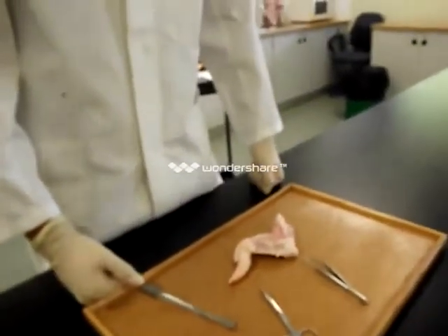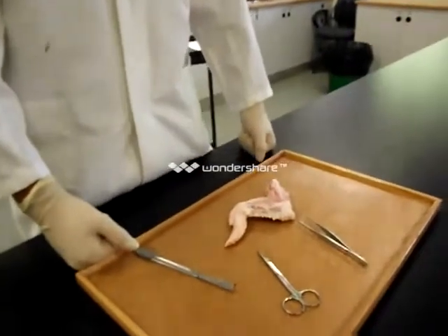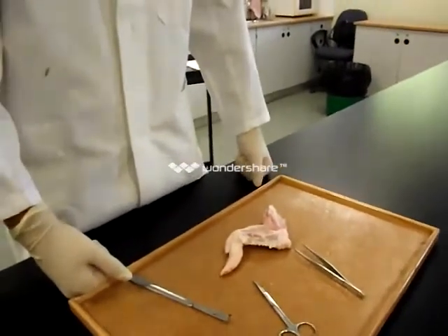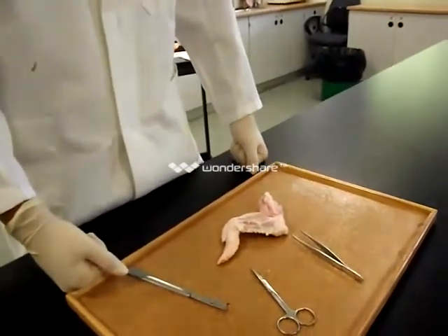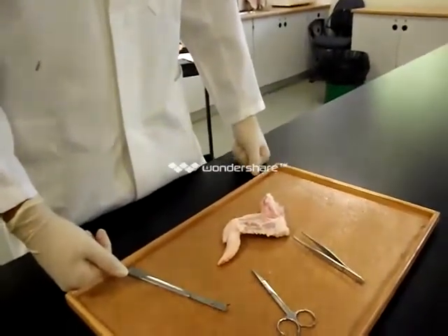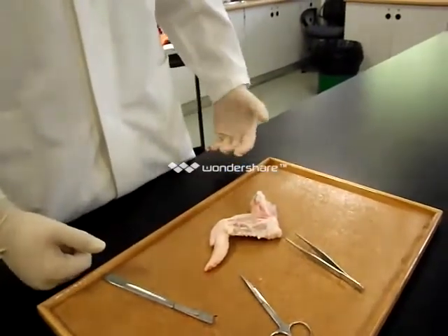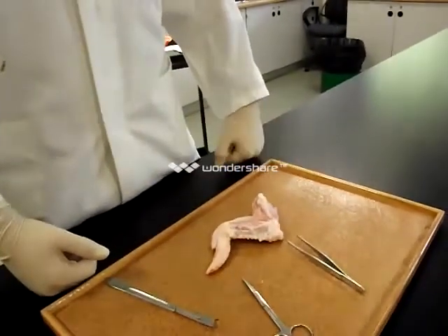Today we are doing the chicken wing experiment to identify ligaments and tendons and how they work on bones. The skin has been removed and the student is going to demonstrate how when contracting the muscles the bones move.